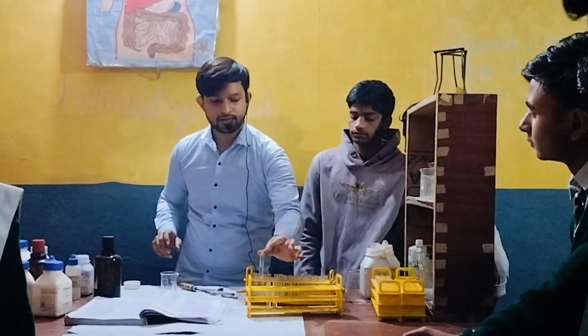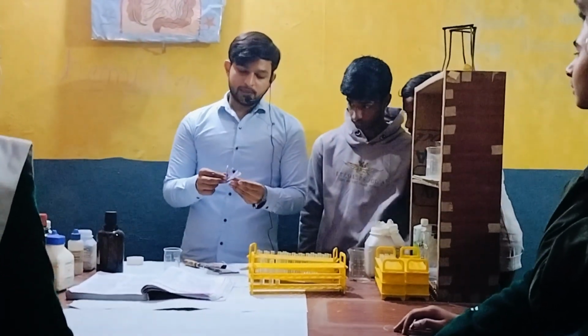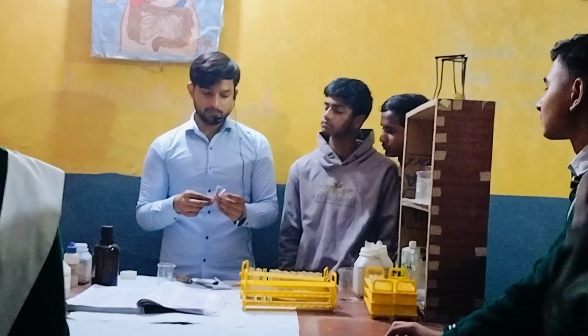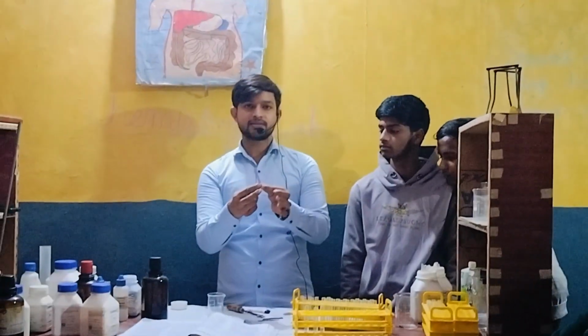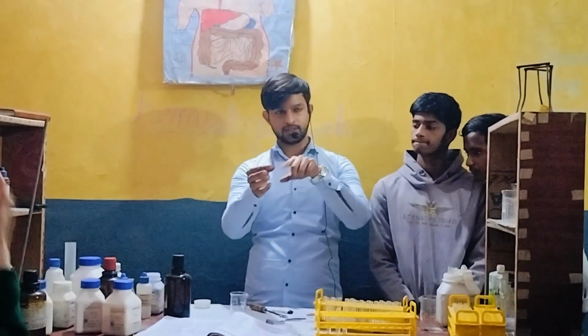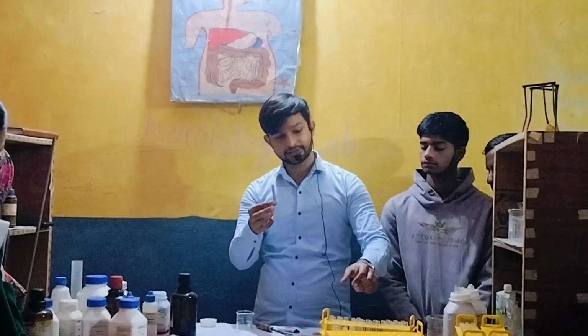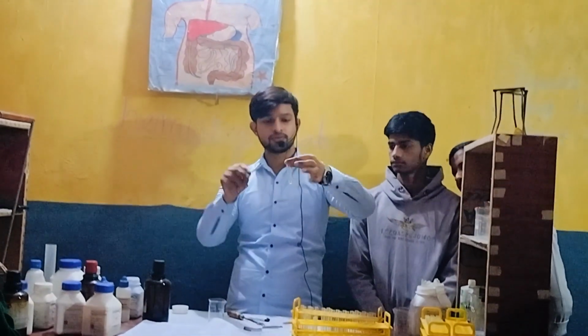Okay. Now just let's perform an experiment with the blue litmus paper. This is blue litmus paper. Yes. Now if I dip blue litmus paper into acid, it converts into red. Okay, let's confirm it. So let's see what is this.